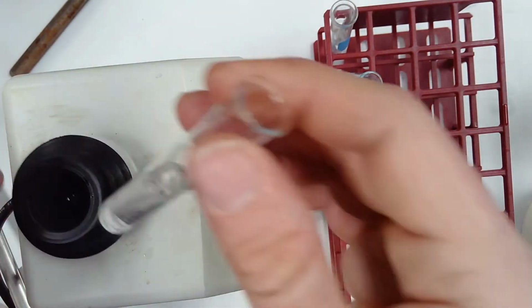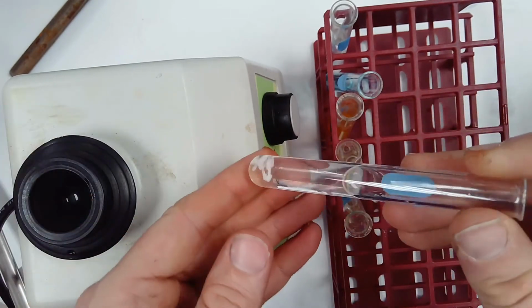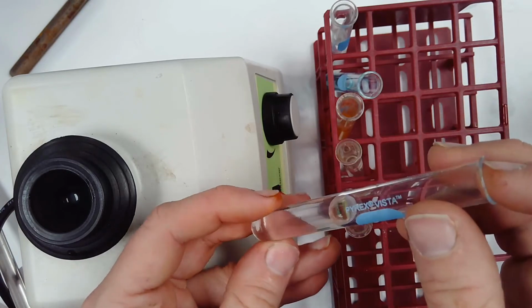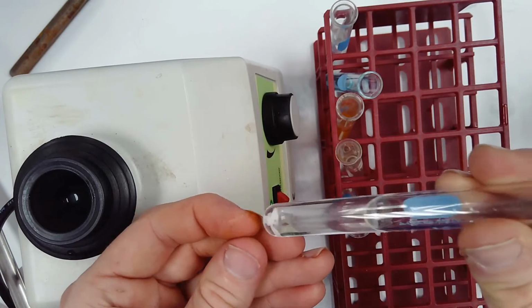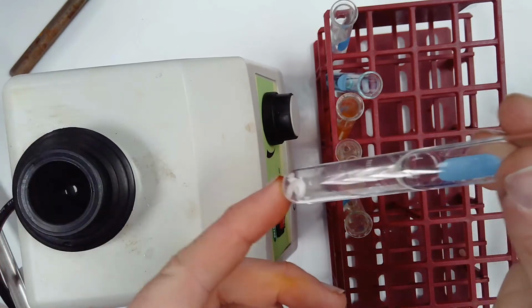I want to point out how much harder this one is to dissolve than others. Just because something is soluble doesn't mean that it's necessarily easily soluble. So you might have noticed I've been sitting here with the vortexer longer on this one to get this phosphate dissolved. That's not terribly surprising to me, but it still needs a little bit more, so here we go.